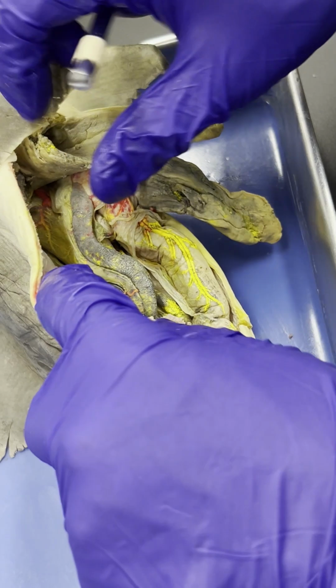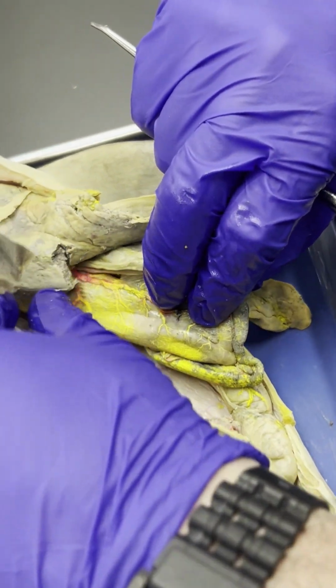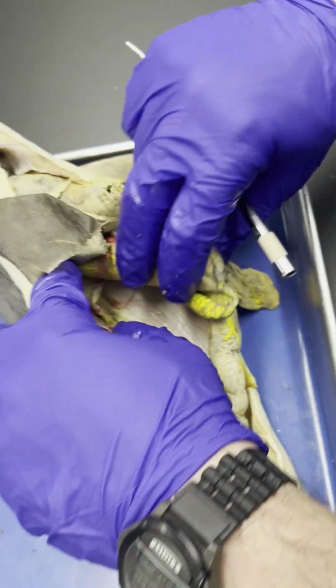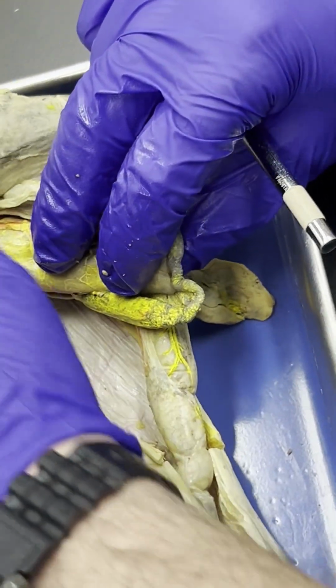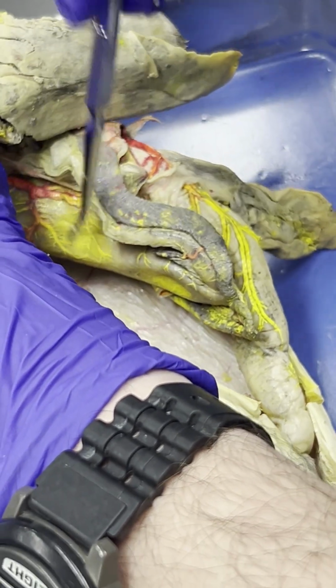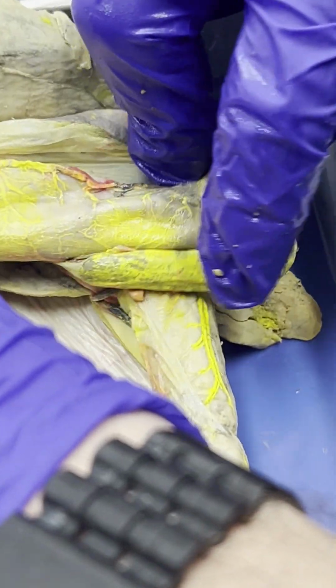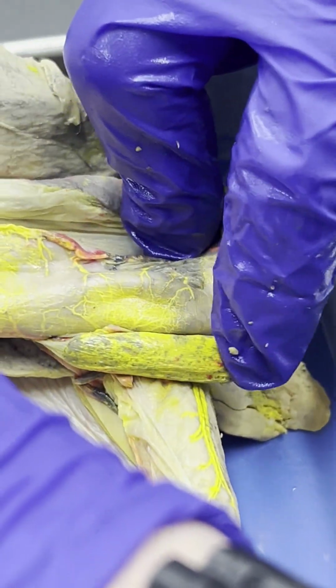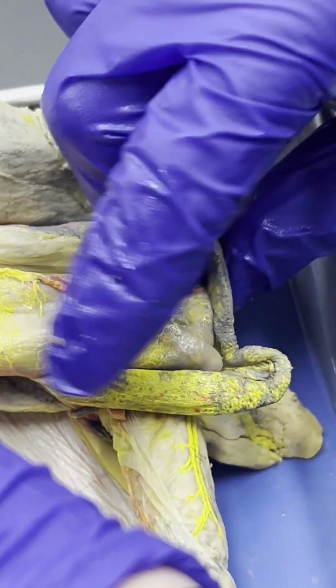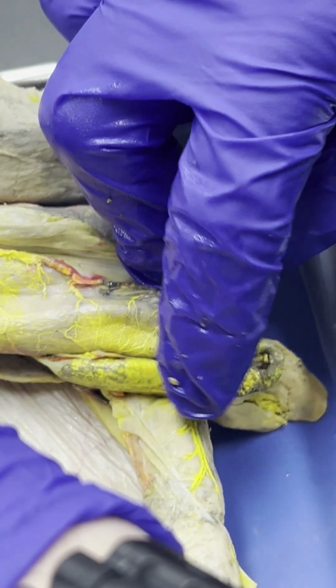We also have the spleen. So we're going to actually go back to the stomach. So again, here's our, trying to take this out. That liver's getting messed up. Sorry, liver. Here's our stomach, but our spleen will actually be right here with my finger. And of course, hopefully you guys know the function of the spleen in the shark and in you.